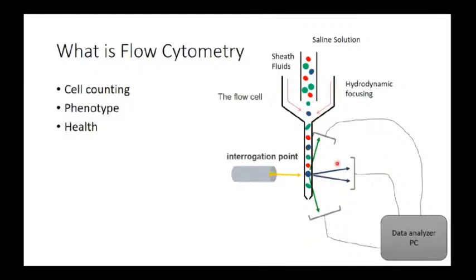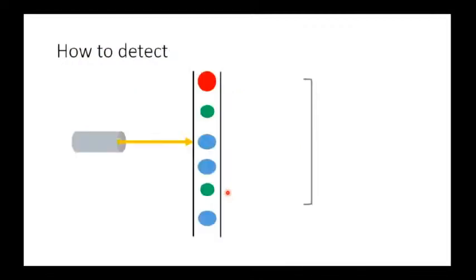And these detectors are connected to a PC or a data analyzer, which is going to analyze the data obtained from the detectors. Now, this is in general. Now, I'm going to speak in more detail.